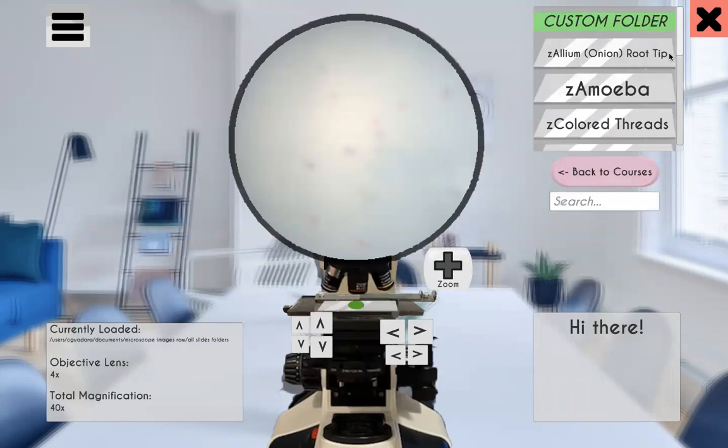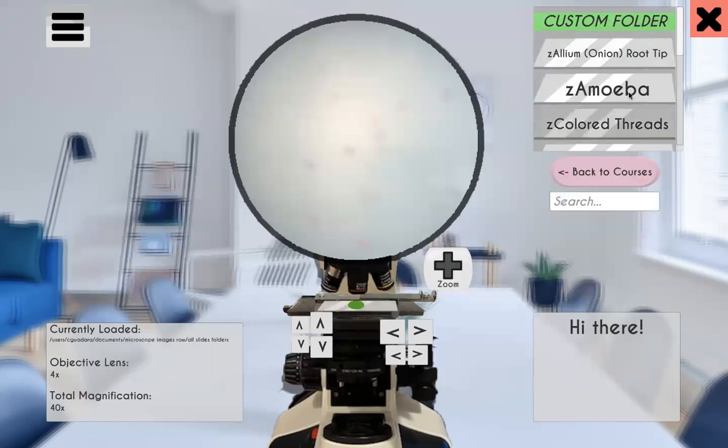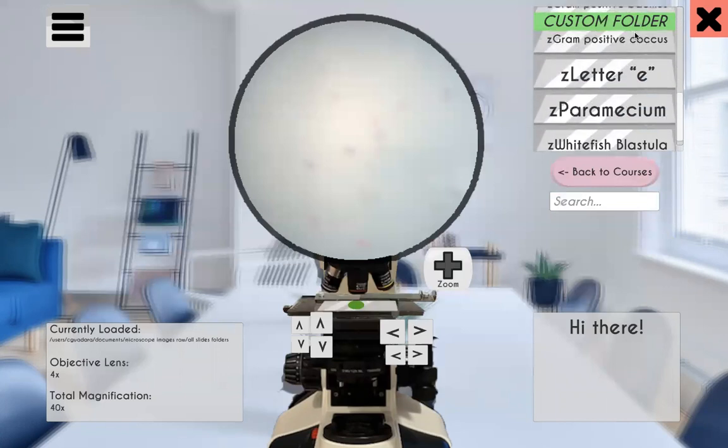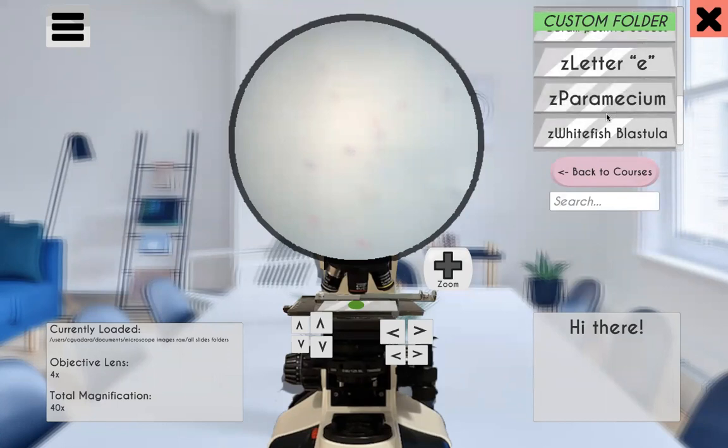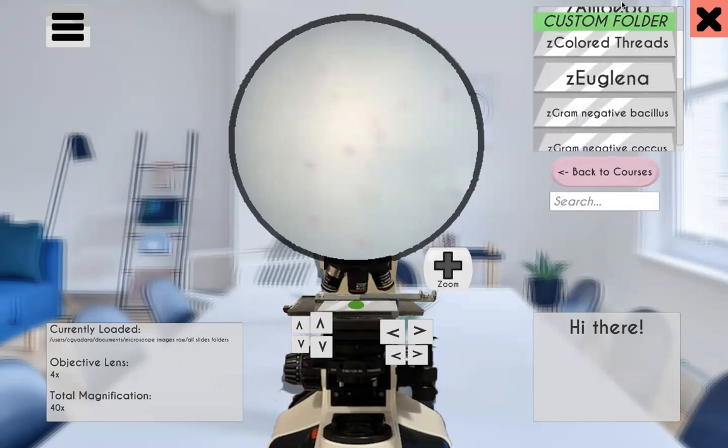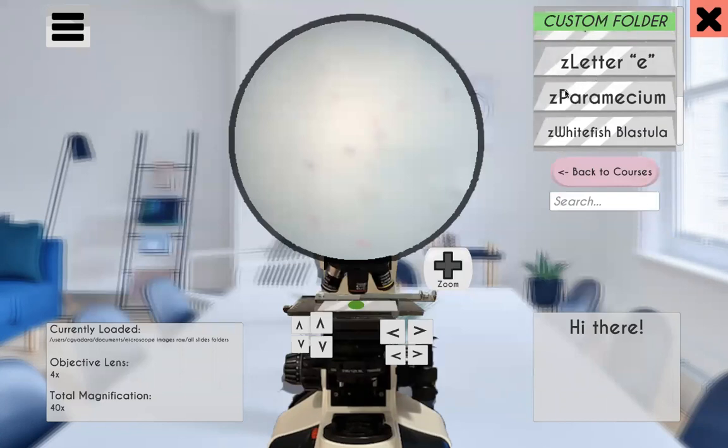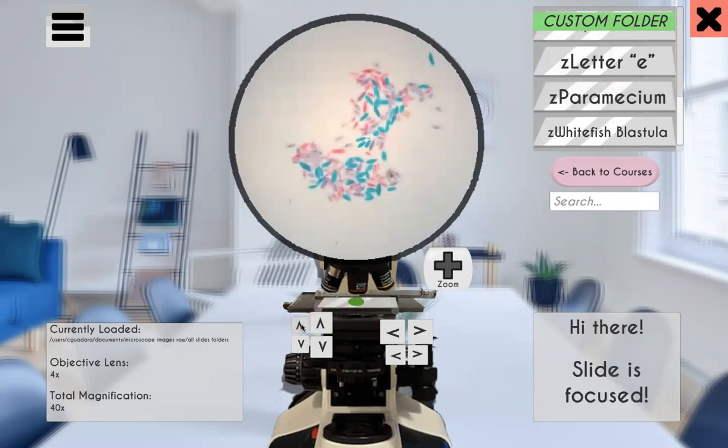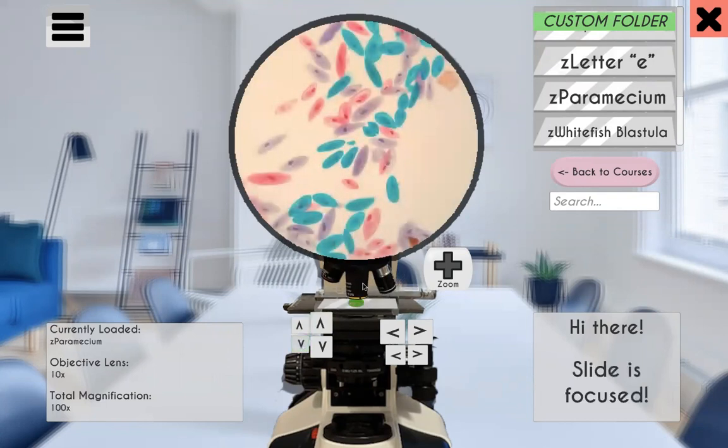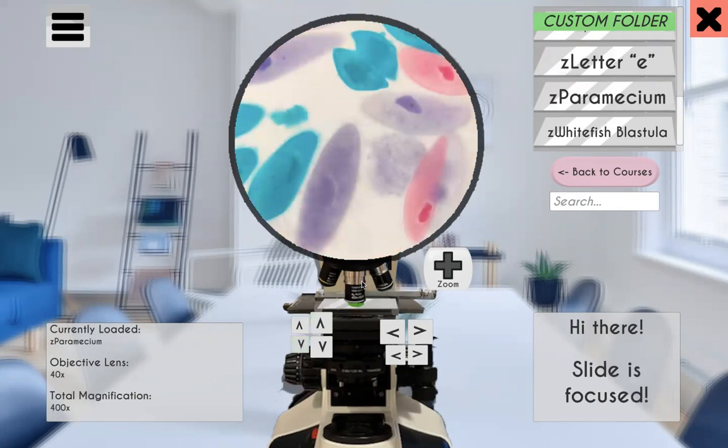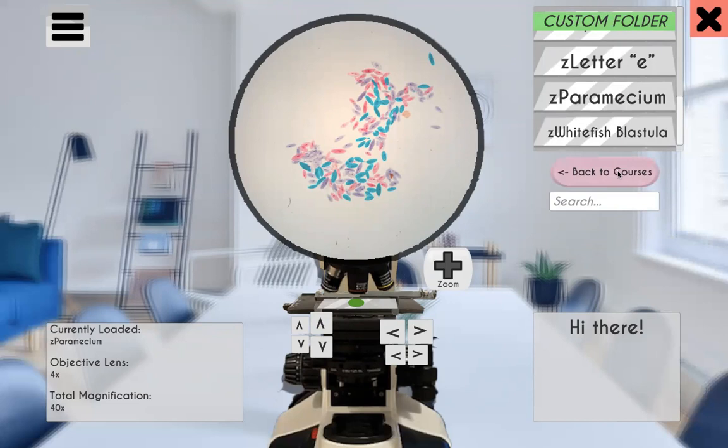And then what we have in the top right is our custom folder full of all of our specimens. And you can just ignore the Z that I put in front of every folder here. That was just for organizational purposes. But now I can load Paramecium, and that's from a folder on my computer. And it has all of the Paramecium images in high def. It's wonderful.